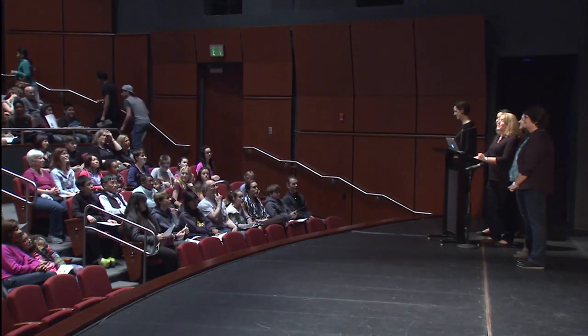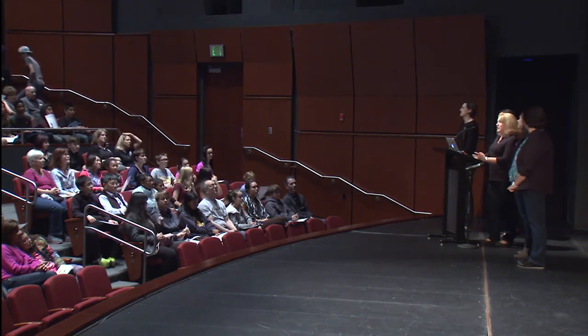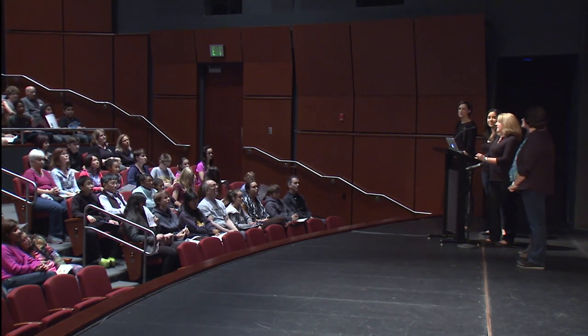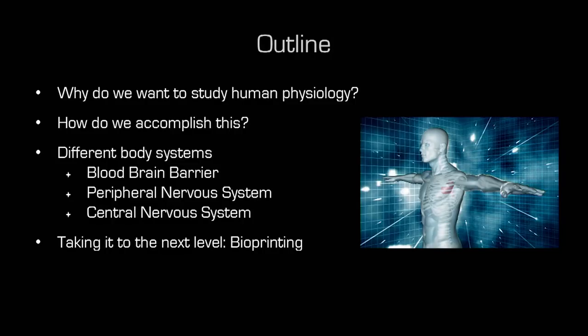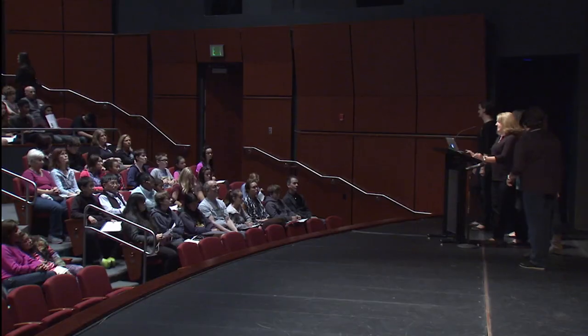All right. What we're going to do today is talk about our project, iChip. What exactly does it mean and how do we use it? Most importantly, why do we even want to study human physiology? We're going to talk about that. We're then going to talk about the engineering that goes into the device. How do we make a human on something we can hold in our hand? We're then going to talk about the different systems we've already designed. We're really focusing on the brain, so we're going to talk about the blood-brain barrier and then the nervous system, both the central and the peripheral nervous system. And then at the end, we're going to tell you where we think this technology is going with bioprinting, kind of the path forward. So what I'm going to do now is hand it off to Chris, and she's going to tell you about why we would even want to study the human body.